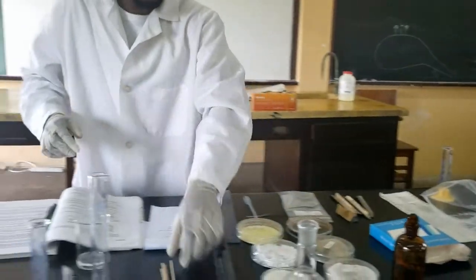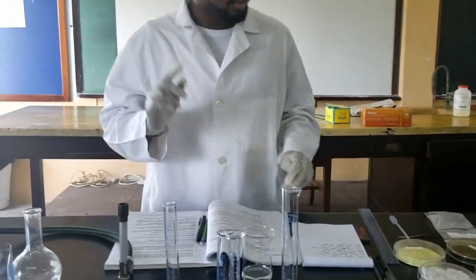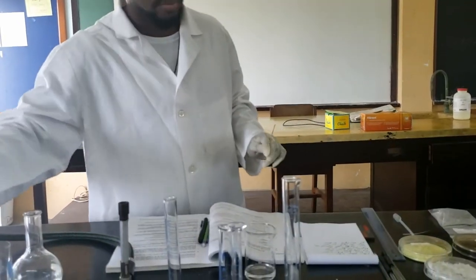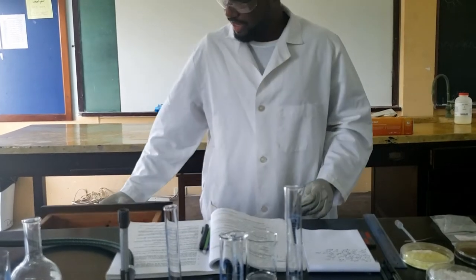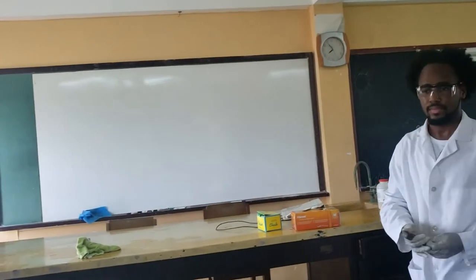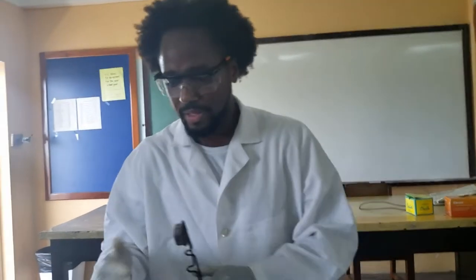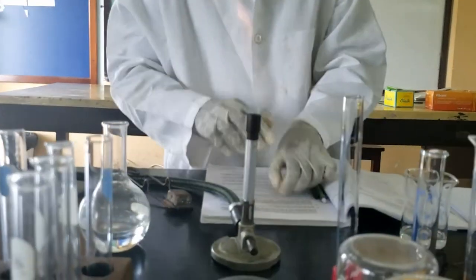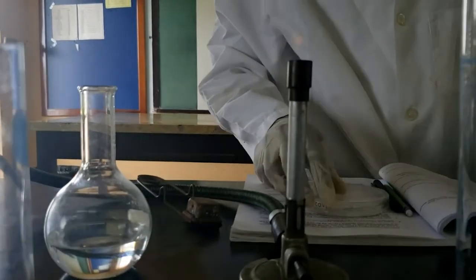Now, a common mistake students always make is they don't read through the procedures first. Before you add the scoop of baking soda to that vinegar, you have to light the splint. You have to light the splint because you'll need to place a burning splint inside when you add that scoop. So here we have the baking soda and a spatula.